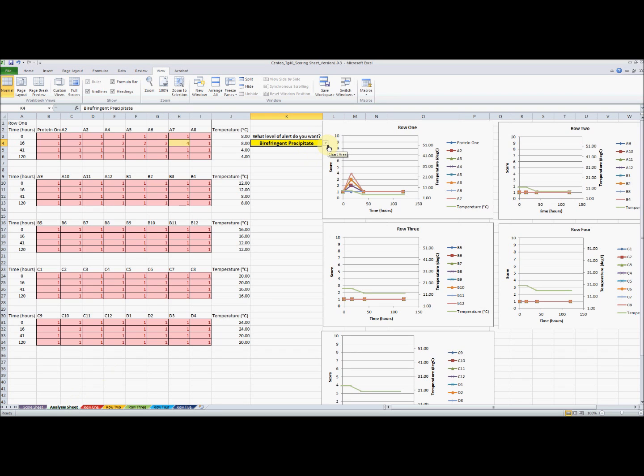What we're doing is quickly letting you eyeball: did I get anything that was vaguely successful? So, let's say I thought that phase separation was vaguely successful. Suddenly some of the boxes change color. Green, because they're scoring above phase separation. So whatever in the list is above phase separation is green. If I just have phase separation, it's orange. And if it's just clear, because it's less than phase separation, that's clear drop, then it remains red. So you can see that it quickly allows you to eyeball.